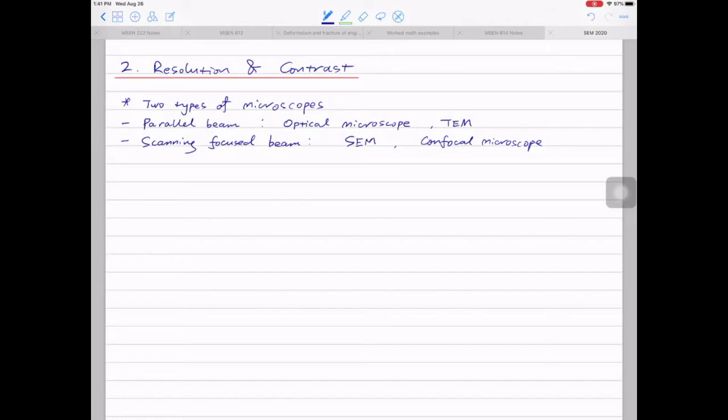One image, like one micrograph, you can spend as short as milliseconds, less than 1 second or way less than 1 second, up to minutes. If you want to get one super high resolution image of a large area, then it can easily take 5 minutes. So if you want to do in situ work in SEM, then you reduce the resolution, you reduce the beam dwell time on each pixel, then you get more real-time information.